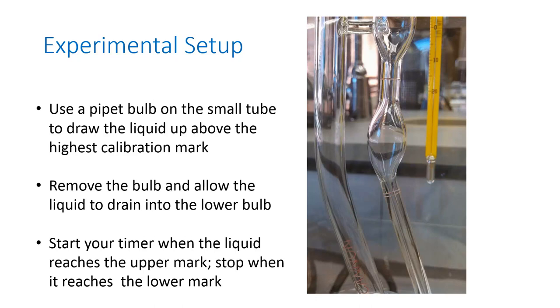You'll notice the lower mark, it looks like there are two lines. There are actually not. This is parallax error because the camera here is at the level of the upper mark. So, which line do you use? Well, you don't. What you do is you make sure that your eye is at the level of the mark that you're trying to read.